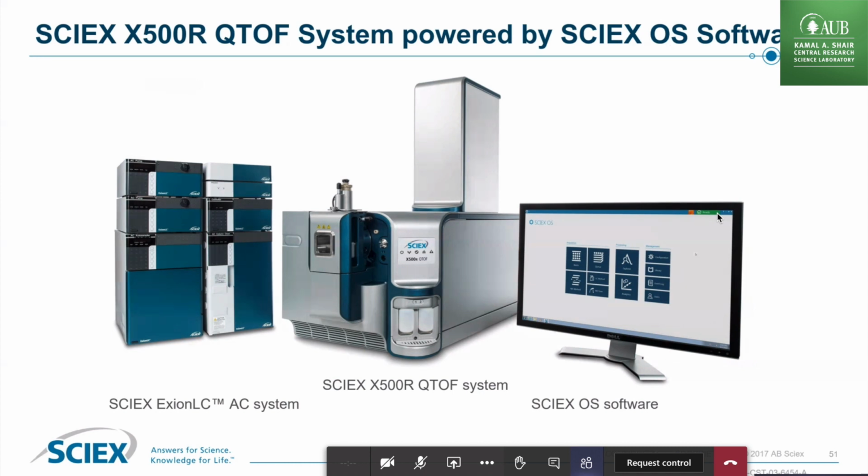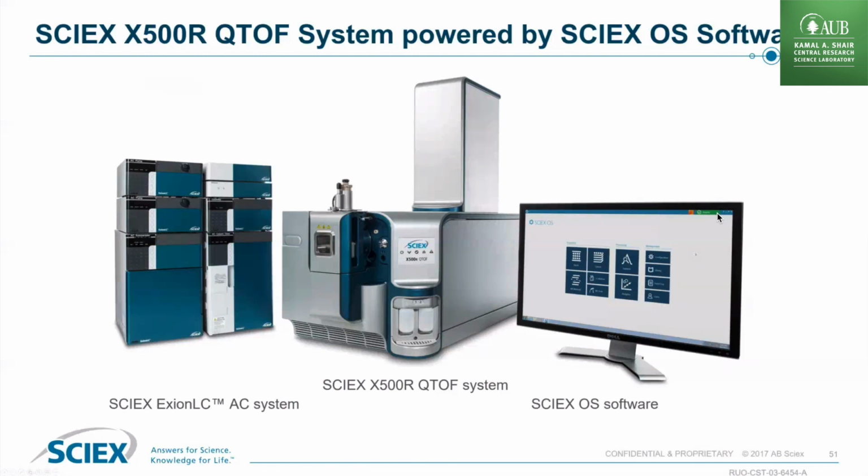Couple points that we'll go through. This is the ion source on the front, and you would have the connection from the LC right here. A silver piece called the grounding T prevents any electricity from the ion source leaking back to the LC. Over here on the left, you have the LC. This is an ExionLC system. I guess this is probably what you have in your lab, although I'm not 100% sure what LC you have.